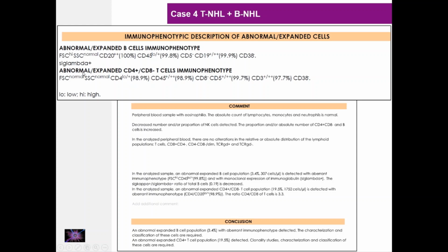And for the T cells, we can see the side scatter is normal, but the CD4 expression is lower compared to the normal CD4 positive T cells.